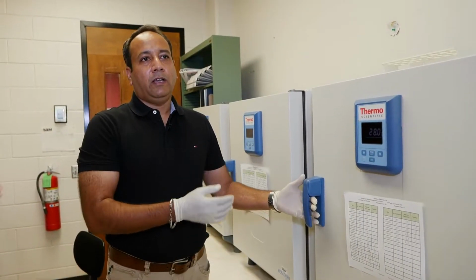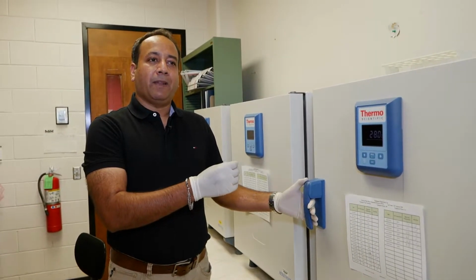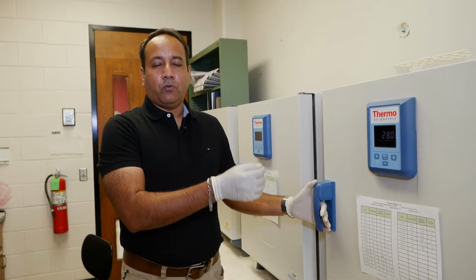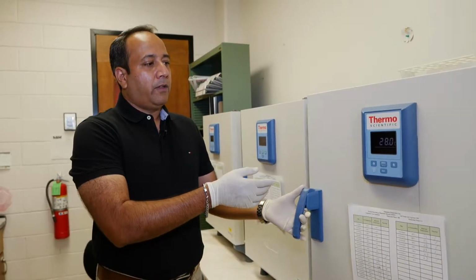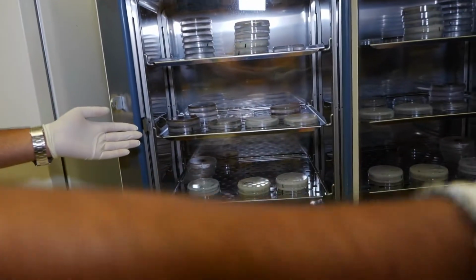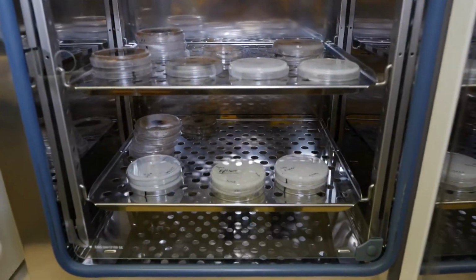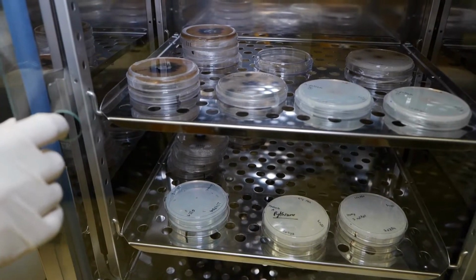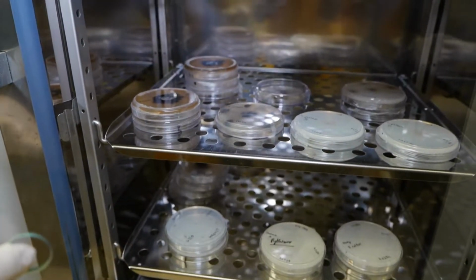So once we plate the affected leaf tissue or the root tissue on the artificial media, we bring them over here and we store them at a specific temperature so that the pathogen can start growing out of it.